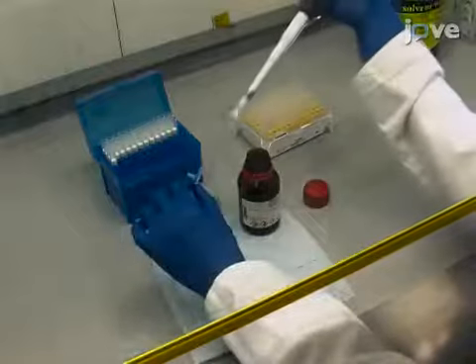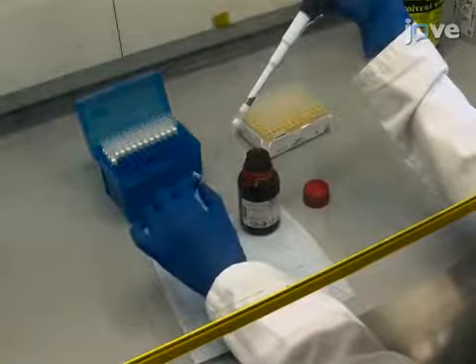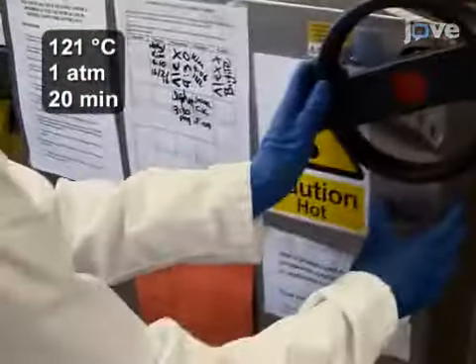Begin by siliconizing the modules before first use. Coat the inner surface with Sigma Coat and allow to dry in a fume hood. Then autoclave the module to increase the life of the treatment.